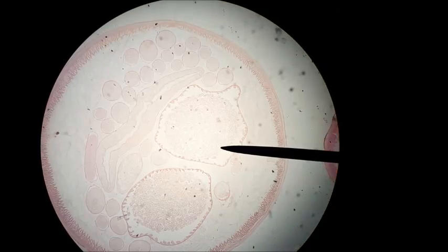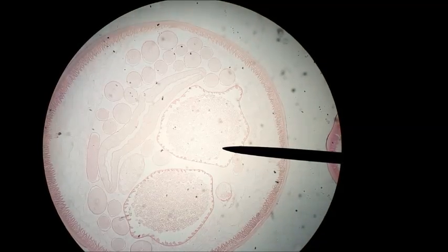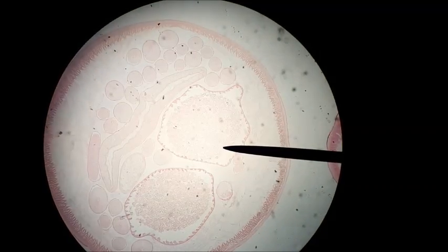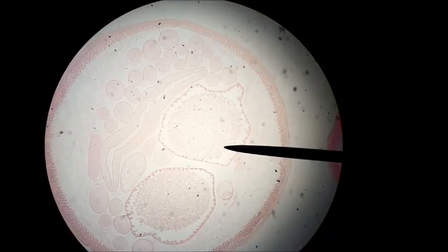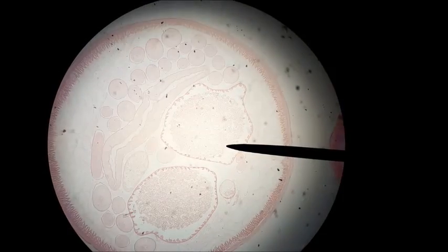These probably grow four to six inches long, Ascaris worms. Apparently very difficult to kill the eggs as well. Very survivable.